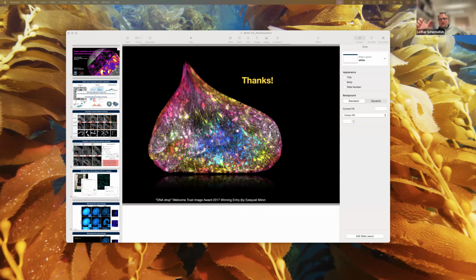So we have probably, in that channel, maybe 150 nanometers in XY, but in Z we still have 300 nanometers. So basically the volume would probably correspond to a size of that. I'm not sure if I'm answering this, going in the right direction. But if the question was, is 200 nanometers too big? Well, maybe it's because of the anisotropic resolution.